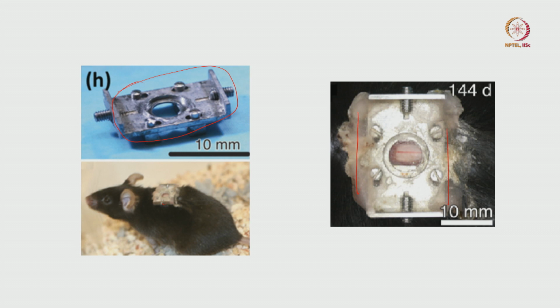So with that, we'll conclude today's session. To summarize, we have covered the craniotomy, the basic steps involved in the craniotomy. And as I said, it is very difficult to cover all the practical steps that are involved. I have tried to demonstrate and I've tried to explain the steps and principles that are required. But whatever said and done, unless you all practice these particular steps on the rodent cadavers, it is difficult to master those steps.